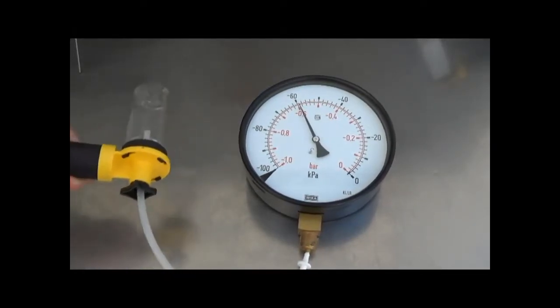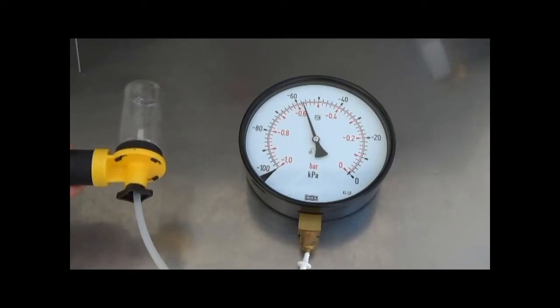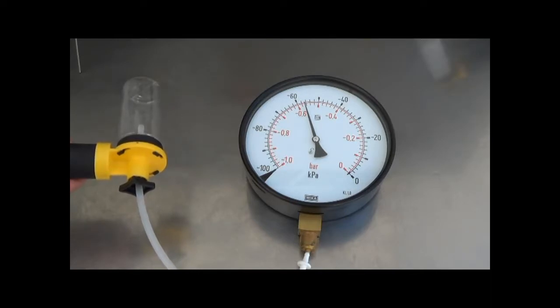The fluid sampler is a powerful tool. Two pump strokes would give you about 50% vacuum in a standard 100ml sampling bottle.